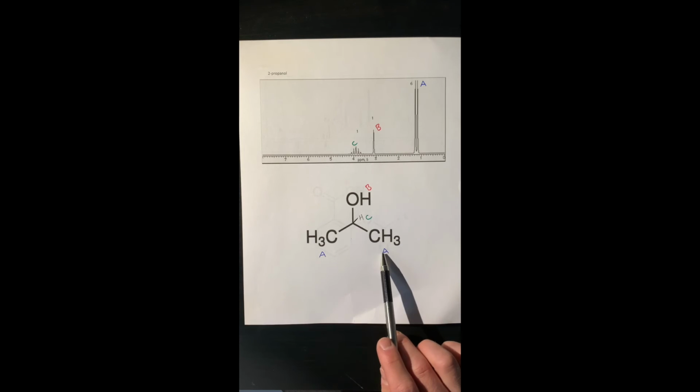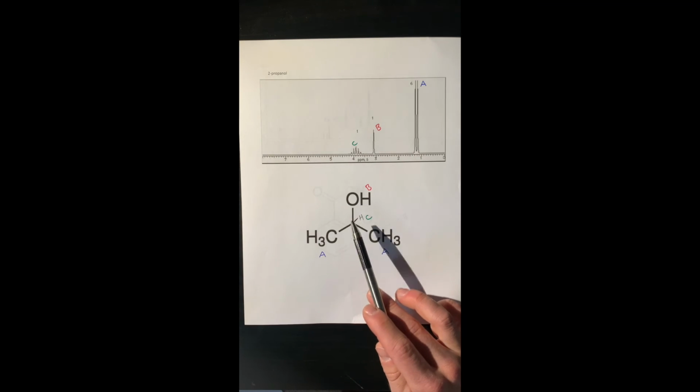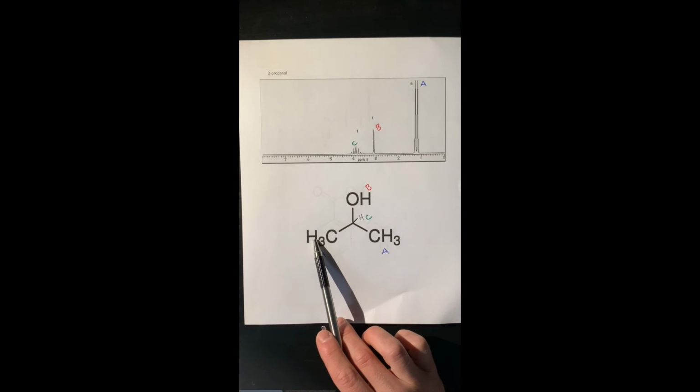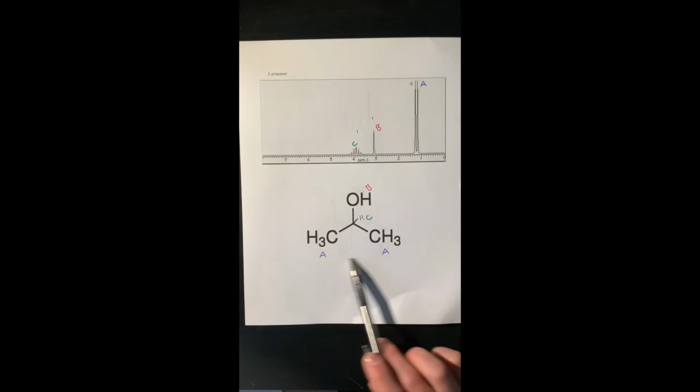And so as you can see, based on the NMR, this first peak equates to 6 hydrogens. That's what this 6 means up here. And it's a doublet as well. And this means that there are 2 equivalent carbons somewhere in this molecule we have here. And as you can see, these 2 carbons right here, both labeled A, they're both attached to the same carbon, which is attached to the same alcohol. So these 2 are equivalent. So this will give off one signal, this will give off one signal, and it'll make a doublet.